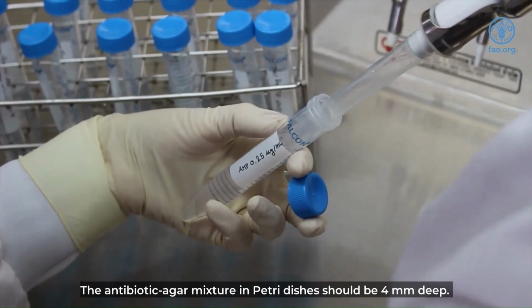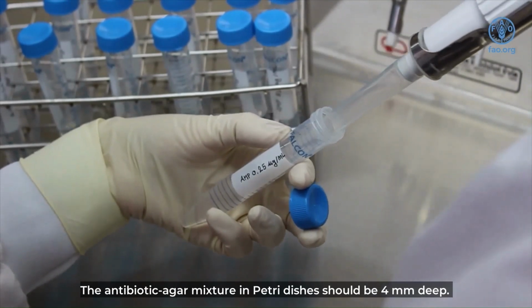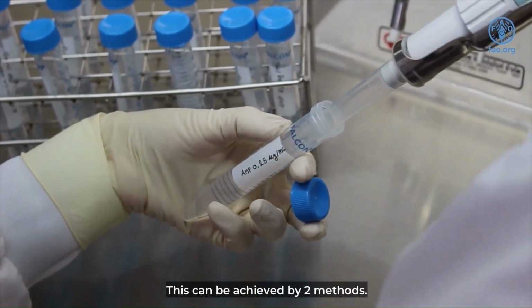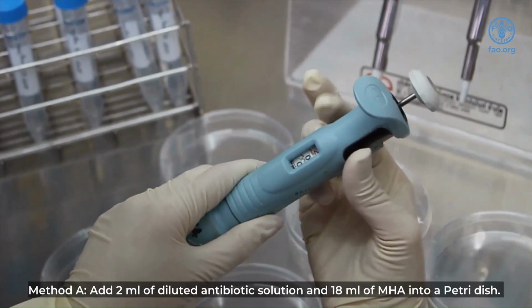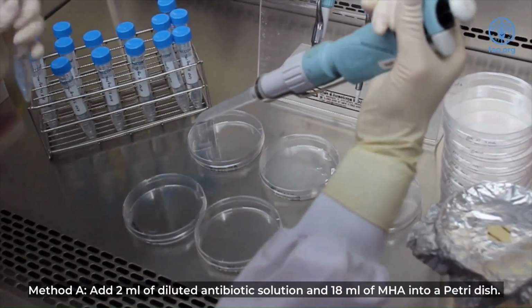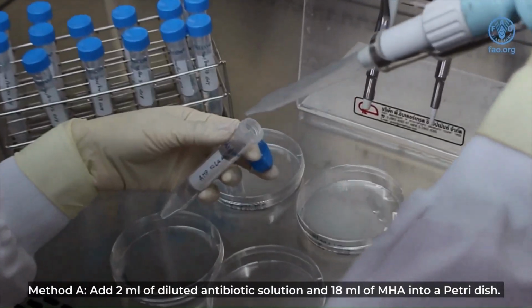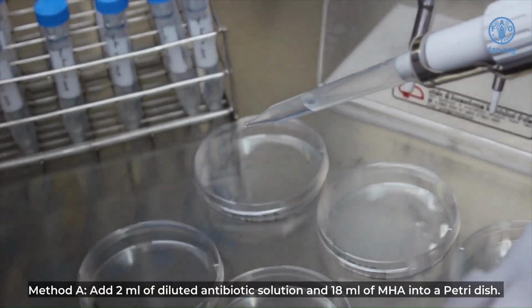The antibiotic agar mixture in petri dishes should be 4 mm deep. This can be achieved by two methods. Method A. Add 2 ml of diluted antibiotic solution and 18 ml of MHA into a petri dish.